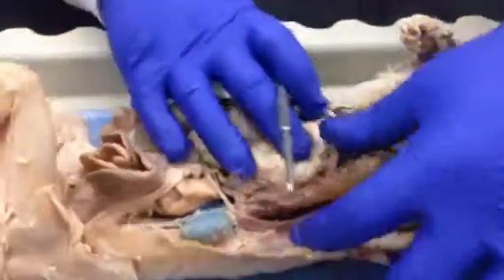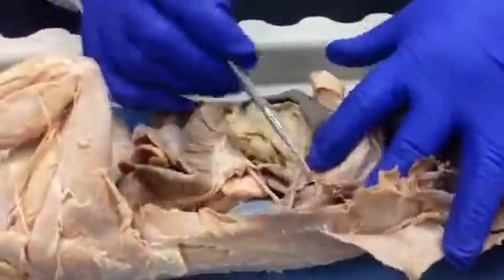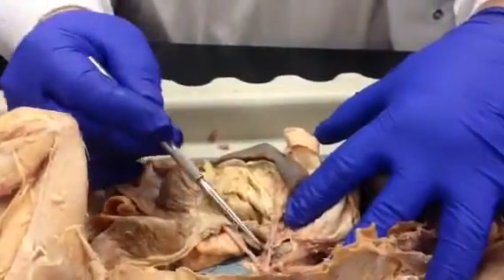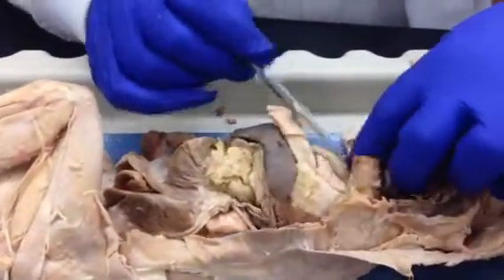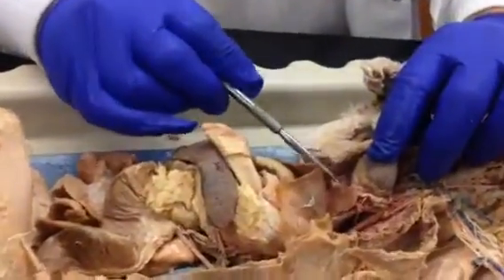Now we go below the diaphragm, and again, just roll the stomach, leave the diaphragm down there. We can cut through the diaphragm so you can see the aorta come through. This is now the abdominal aorta. There's our kidney in the background. And there's our inferior vena cava, which we can also see right here as it comes out of the heart. That big vein right there that's going down.